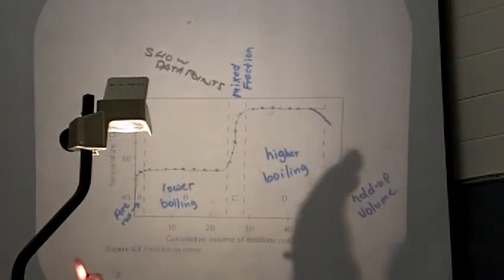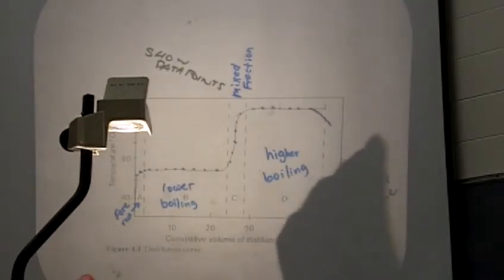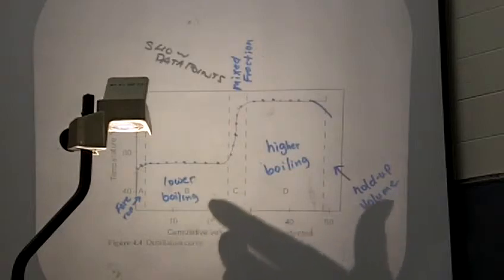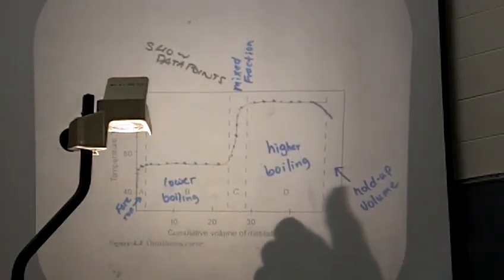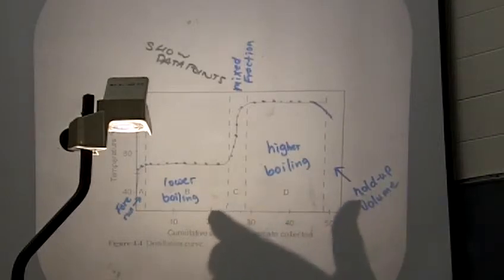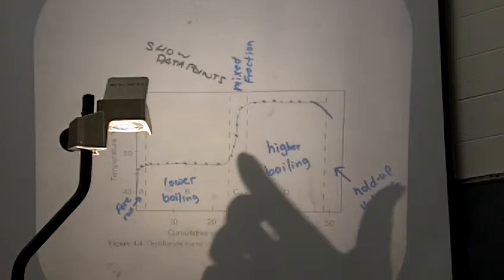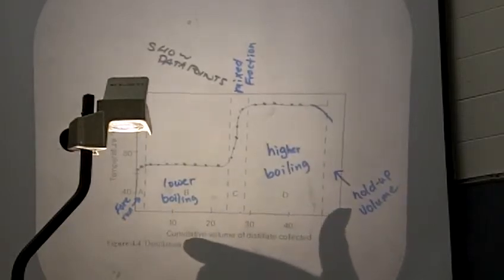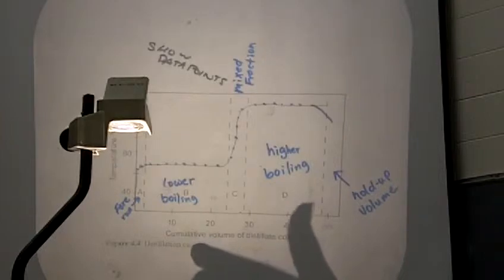Then for experiment 4, I'm going to show you in a little bit, there's going to be report sheets that you hand in as well. Part of that report sheet is a nice drawn or Excel drawn, nicely computer generated graph. You want to include that on your report sheets, okay? But in lab this week, we don't expect that you get a nice Excel drawn graph. We just want you to put a rough draft in your notebook, all right?